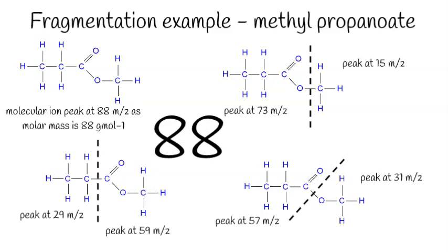Also note that all of these peaks are possible. And also, we could have a situation where we do not find some of these, even though this is the answer. Sometimes fragments do not last very well in the mass spec and do not get detected very well, and sometimes there's not very much of them, so we wouldn't see the peaks at all.